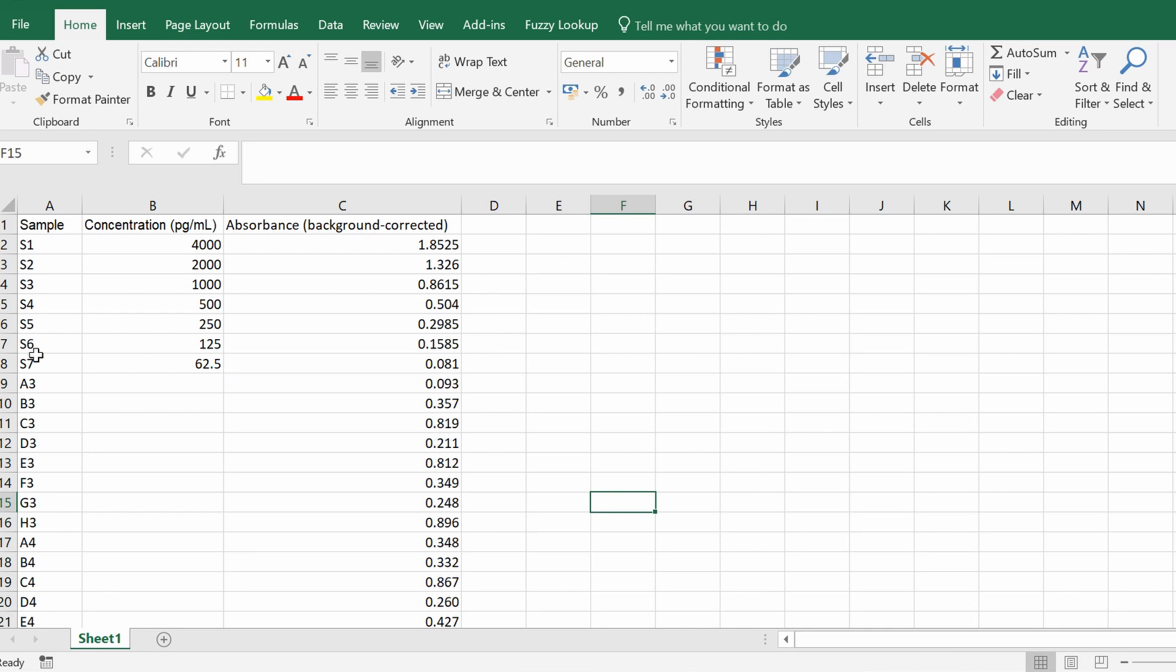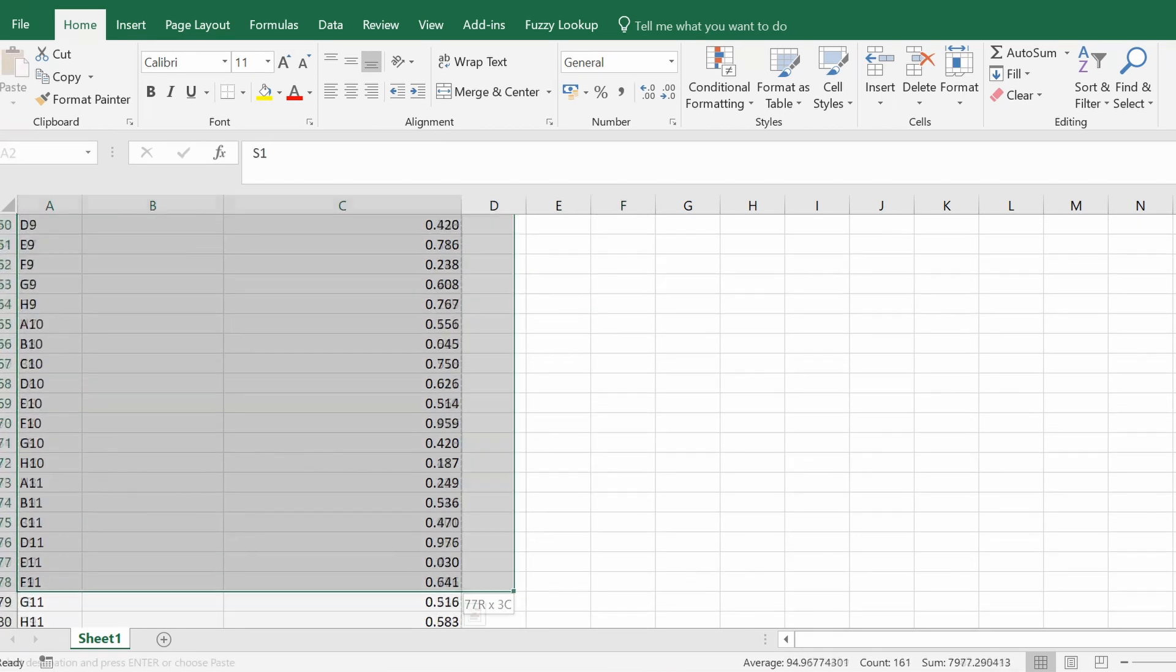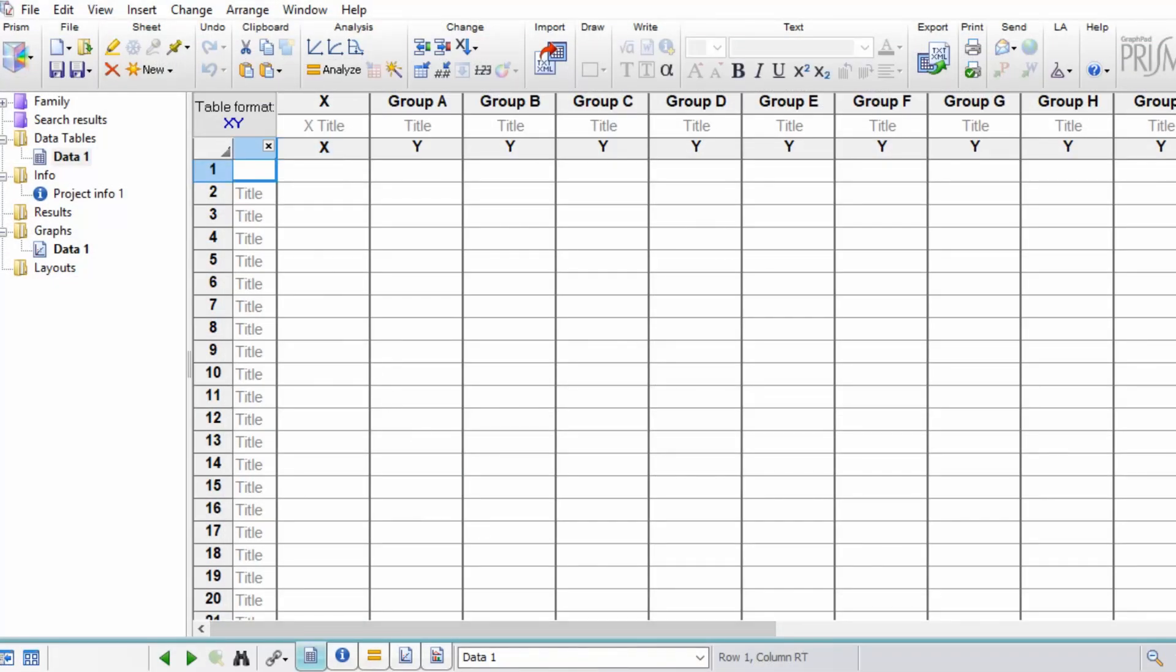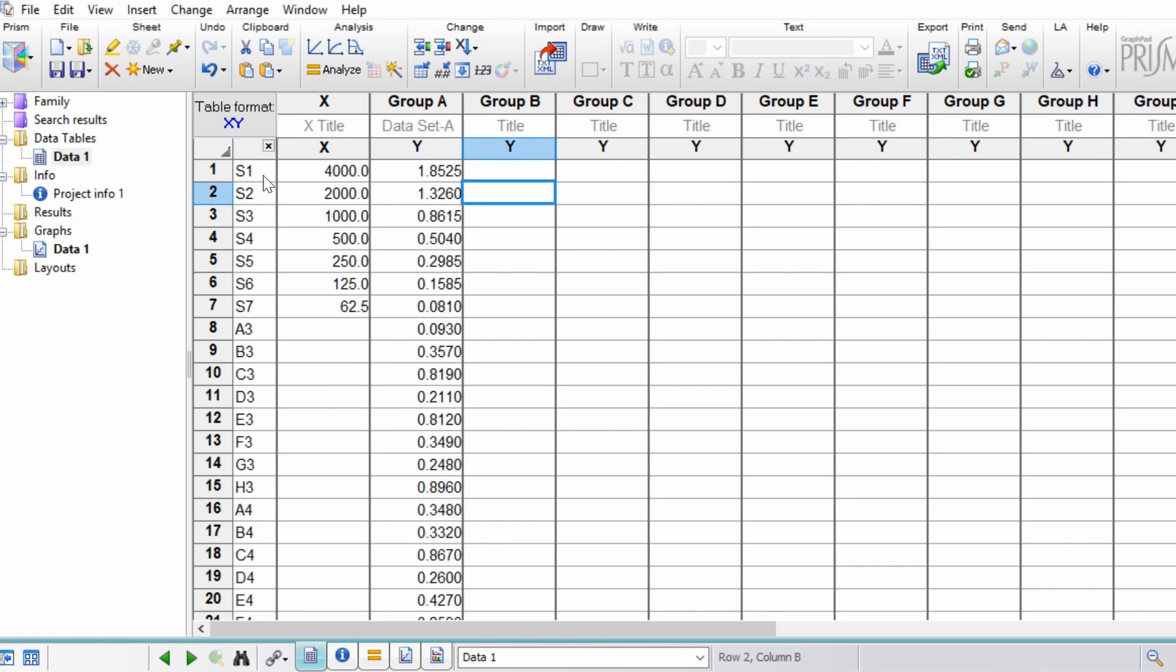So what I'm going to do is just copy all of this and I'm going to go to GraphPad and paste this into the datasheet. In the title columns area, you can enter your sample names.